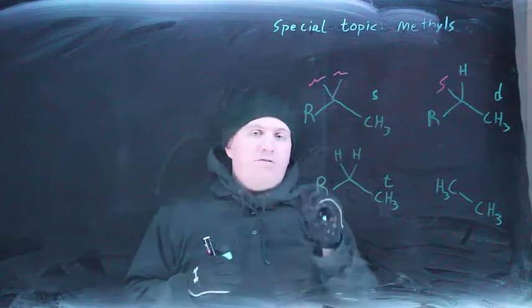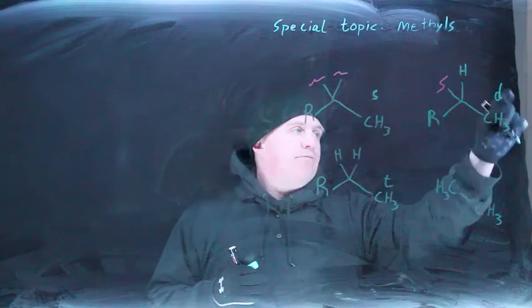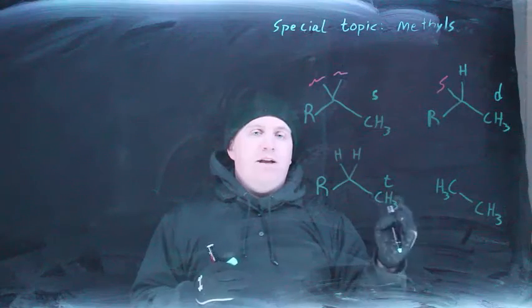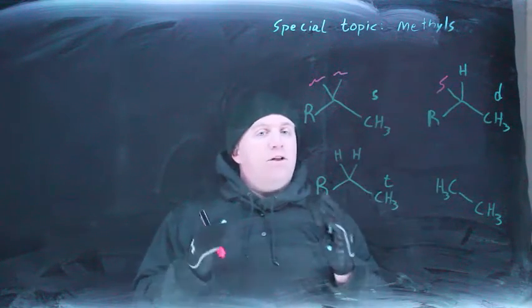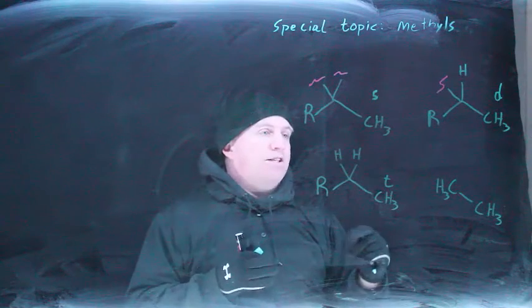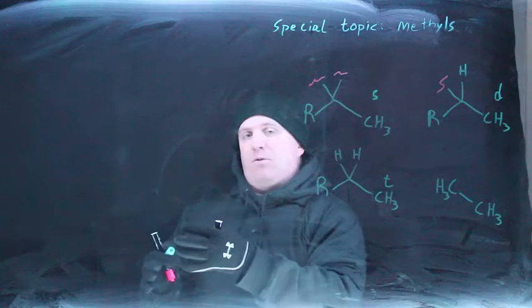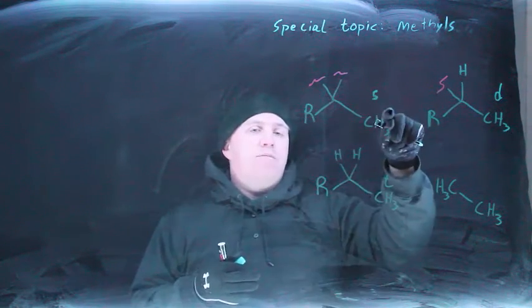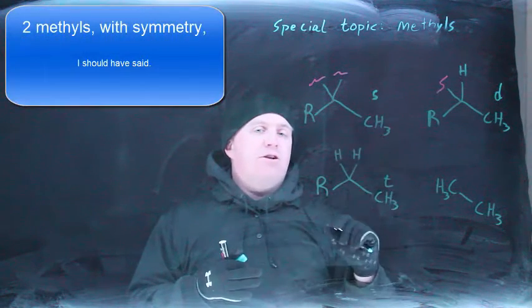So what are the official allowed multiplicities for a methyl? Singlet, doublet, triplet, that's it. If you see something that integrates for 3, but is not one of these 3 options, then you're not looking at a methyl. Likewise, if you see something that should integrate for 6, and it integrates more like 7, but it's a singlet worth about 7, then I'm going to strongly assume it's a methyl unless proved otherwise, and you need to interpret your integration a little bit better.